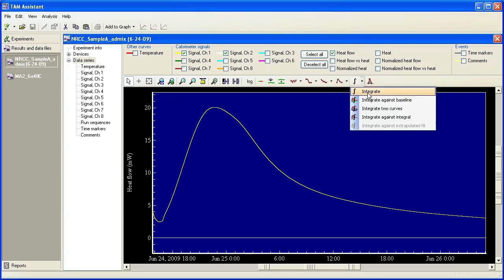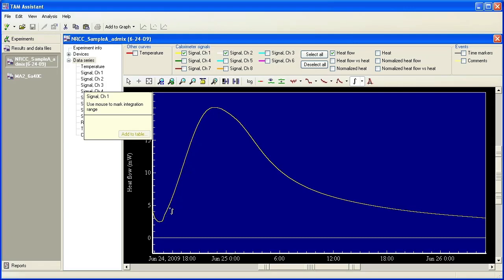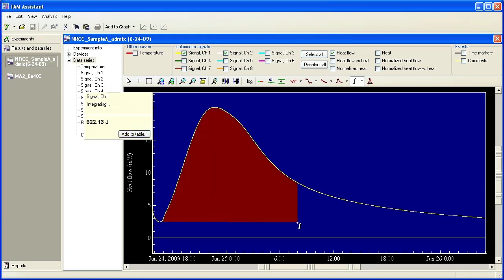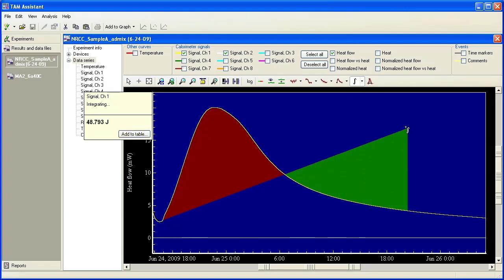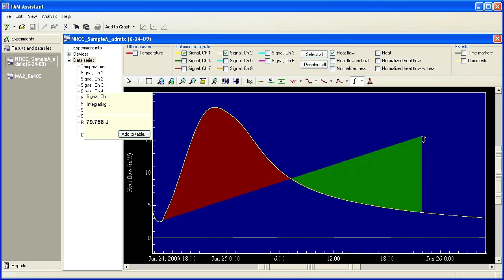Once I select integrate, you have to select a curve to integrate. You can see that this curve is highlighted. If I select it, now I have the integrate symbol. Once you click over the curve, you can drag and integrate linearly to wherever you drag the cursor.